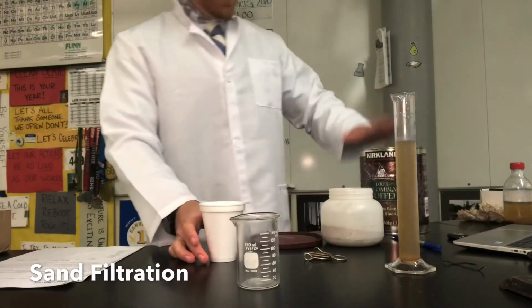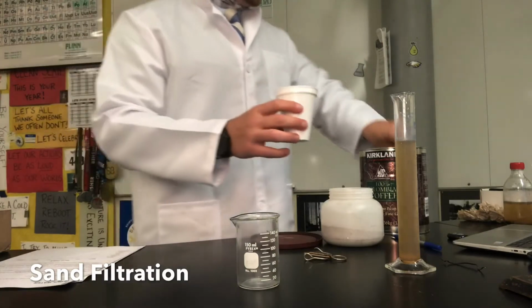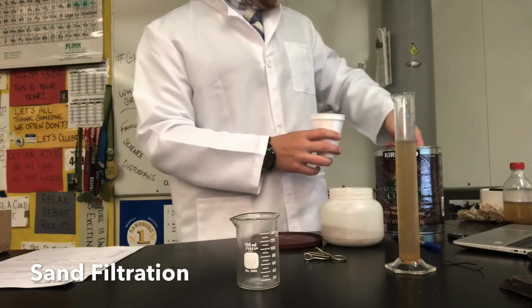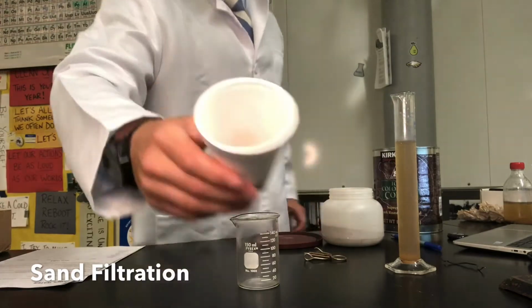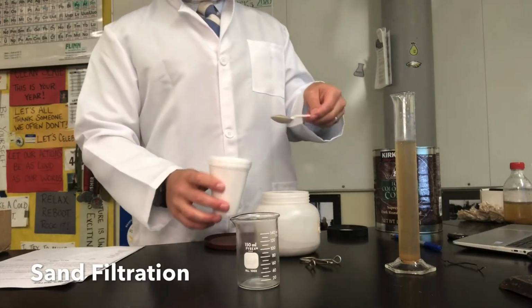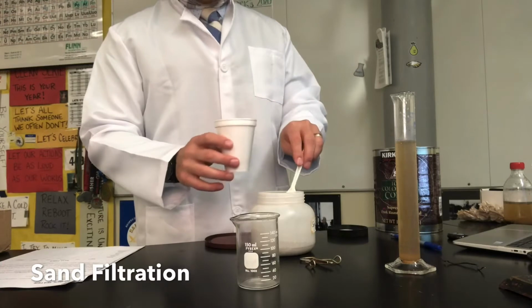So now I have a container of gravel and sand, and what I'm going to do is take a simple styrofoam cup, and I'm going to put a layer of gravel at the bottom of my cup. You may be wondering, what's gravel gonna do? You can see the gravel inside of there, all right? I'm then going to take spoonfuls of sand, which is a lot finer. I'm gonna take 2 scoops of sand, okay?